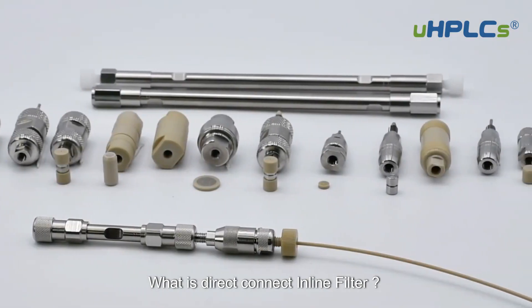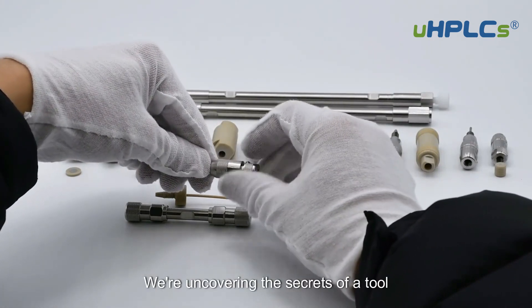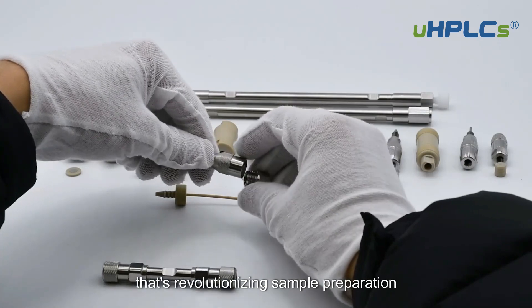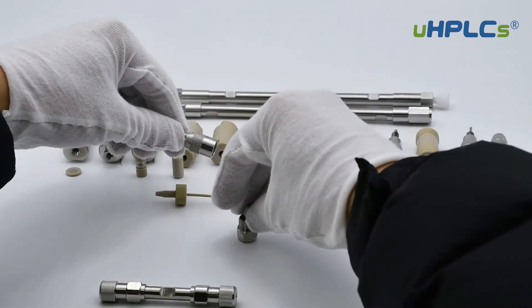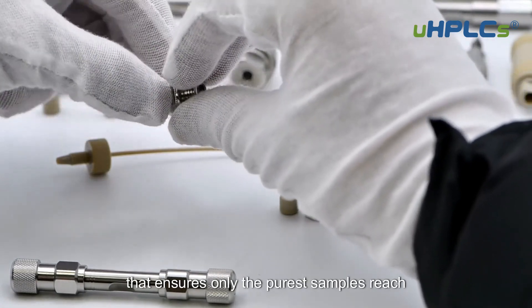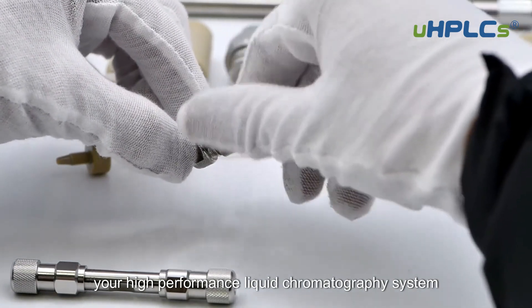What is a Direct Connect Inline Filter? Welcome, science enthusiasts! Today we're uncovering the secrets of a tool that's revolutionizing sample preparation in labs worldwide: the Direct Connect HPLC Inline Filter. But what exactly is it? Imagine a guardian that ensures only the purest samples reach your high performance liquid chromatography system.